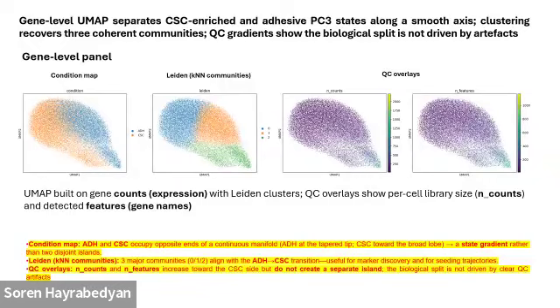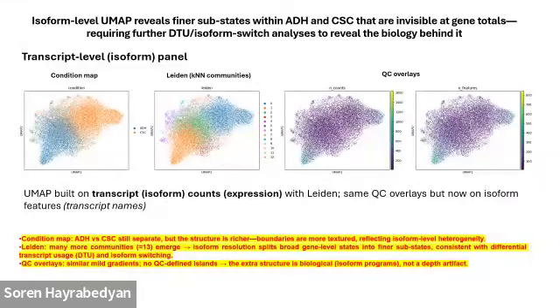Then these 2 figures show that there is no separate cluster of cells that will carry the most expressed genes. It means that technically there are no artifacts in this data set. Similarly, when you use the advantage of long reads, you have transcripts directly. And as you see on the first graph in orange, you have the stem cell population.